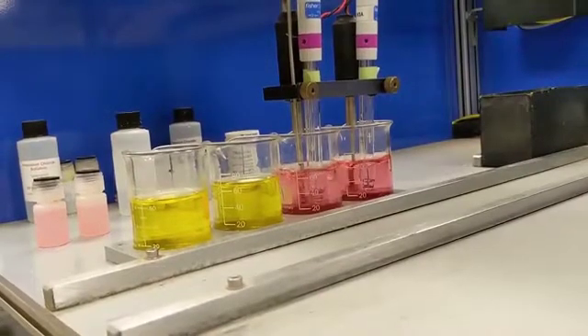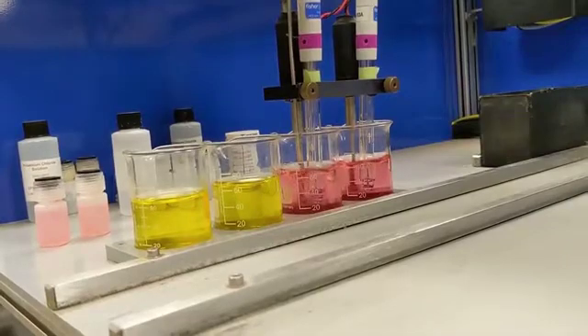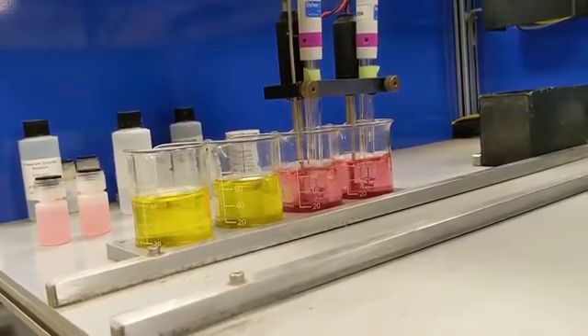Before samples are analyzed, the pH analyzer is calibrated using a 4 pH buffer in pink and a 7 pH buffer in yellow.